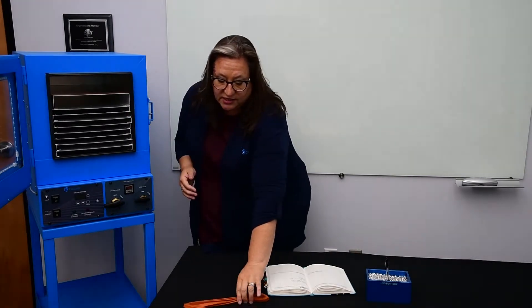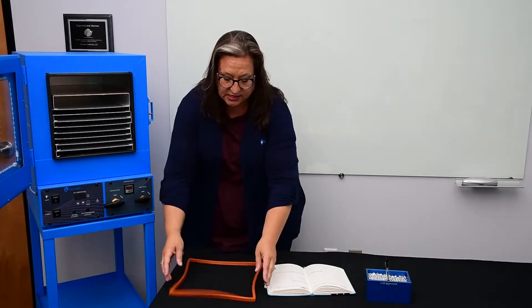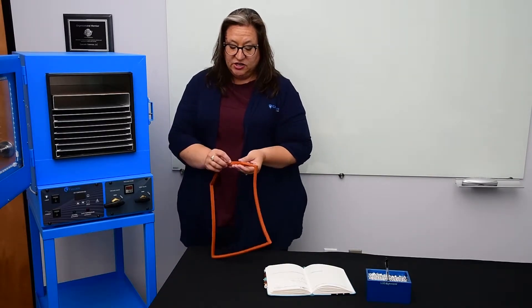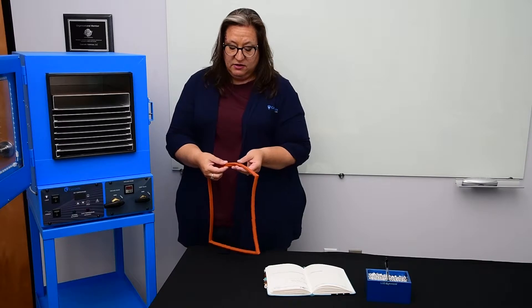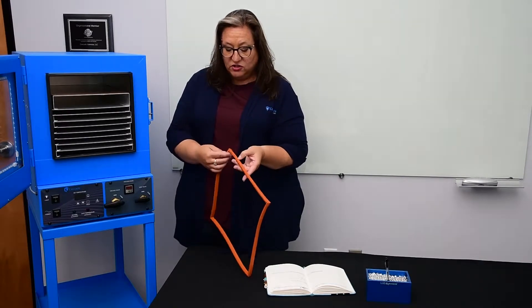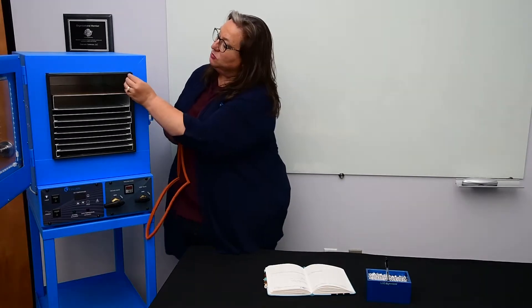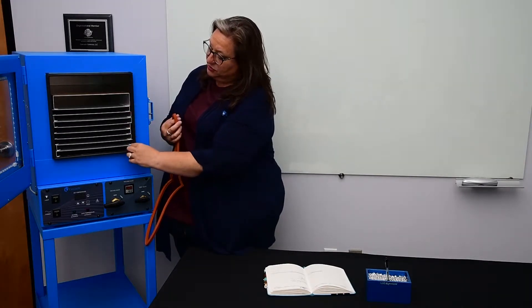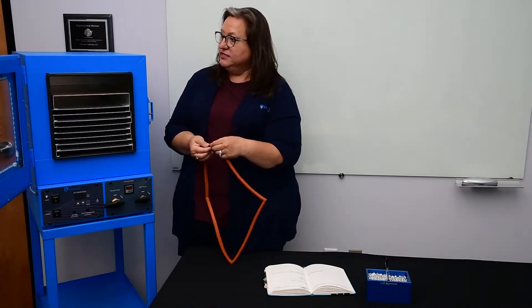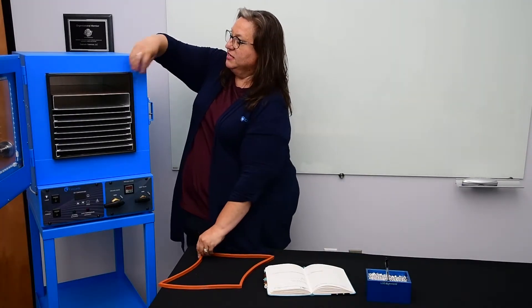I wanted to look at this gasket here because I think that the orange silicone is a little bit easier to see the way that this works. We have essentially a false o-ring in this gasket, where there's a ridge that protrudes all the way around, acting like an o-ring on this gasket that sandwiches right over the flange.